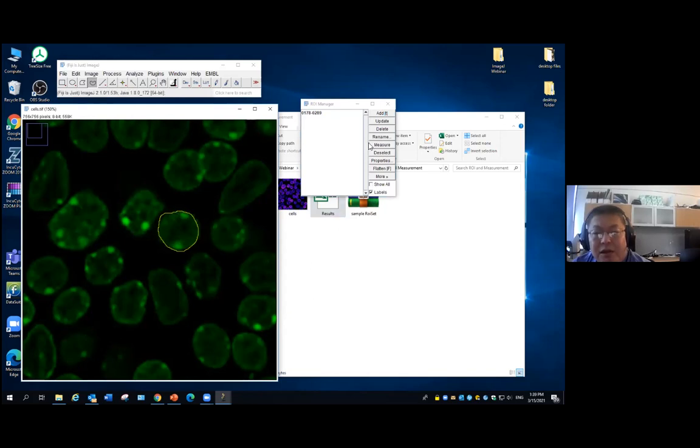Okay. Then I say I want to add it. So now I have two of them. You can click this show all here to show you this is 1 and 2. Then I can draw another one.